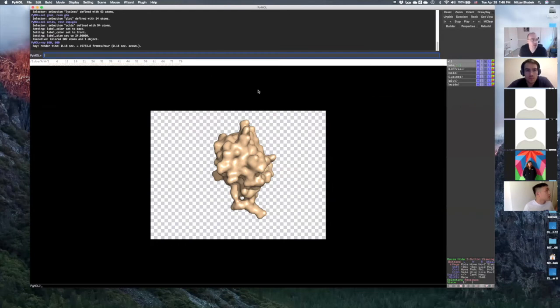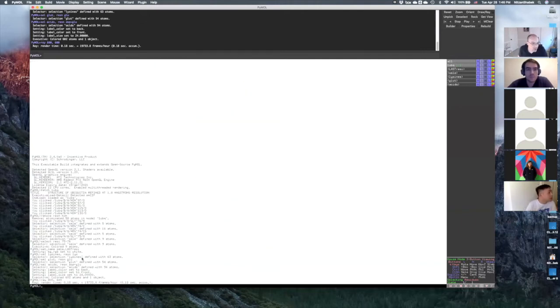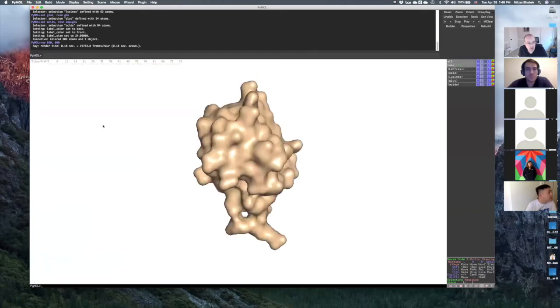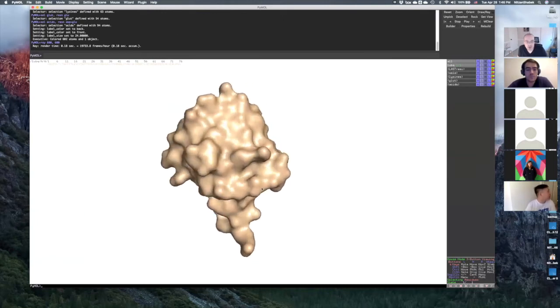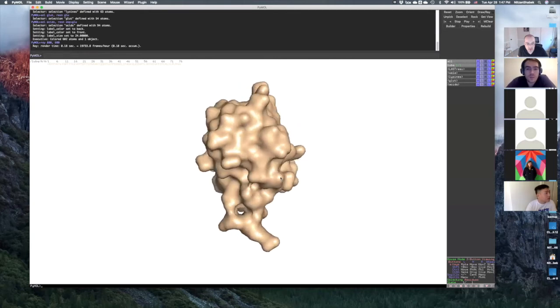And okay, good. So let's go back to the structure. Just click somewhere. By the way, I want you to know that if you press escape anytime, you just see the command line over here, so you can see all your history. So press escape, you see this one, this is your command line, and this is the frame. Anytime that we do more substantial work, I usually recommend going to File and saving the session as. When you save the session, you can always go back to the exact session where you left it. Otherwise, it's very hard to undo. So every now and then, I like to save the session.